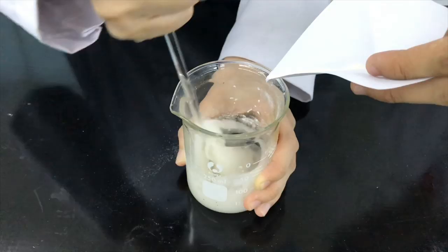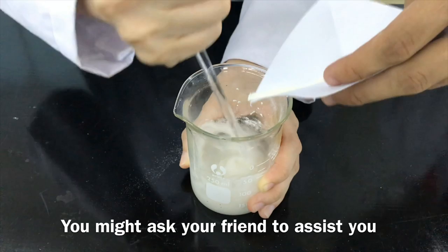You might ask your friend to assist you as it is very difficult to do by yourself. Heat the gel with continuous stirring in order to speed up the gelling process.